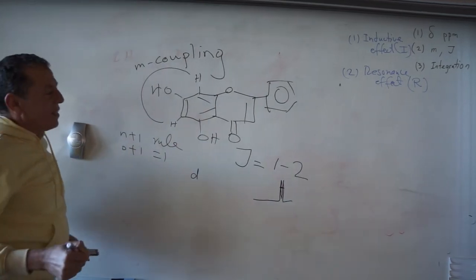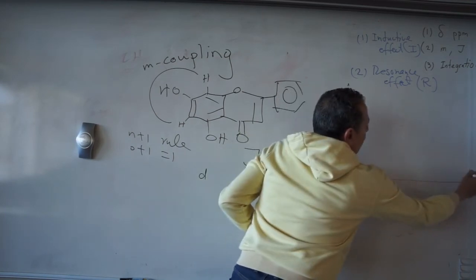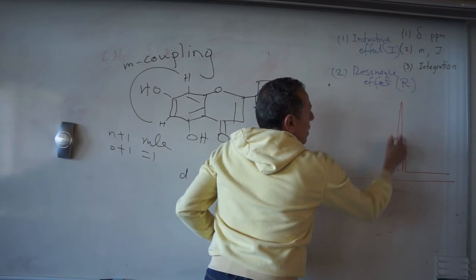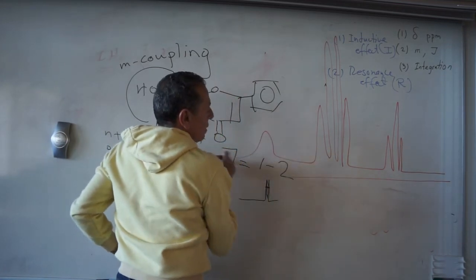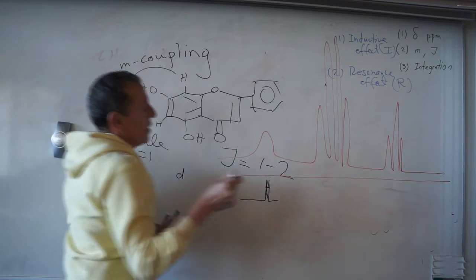What about the last point here, which is about integration? As we have seen in the last example about the alcohol, the last spectrum about ethanol.